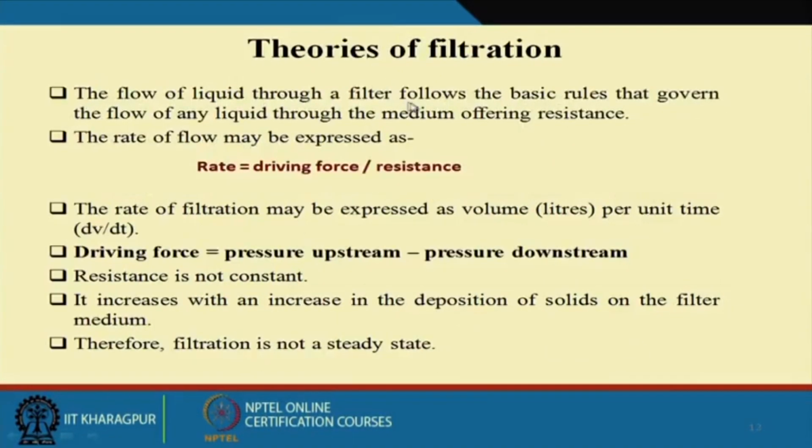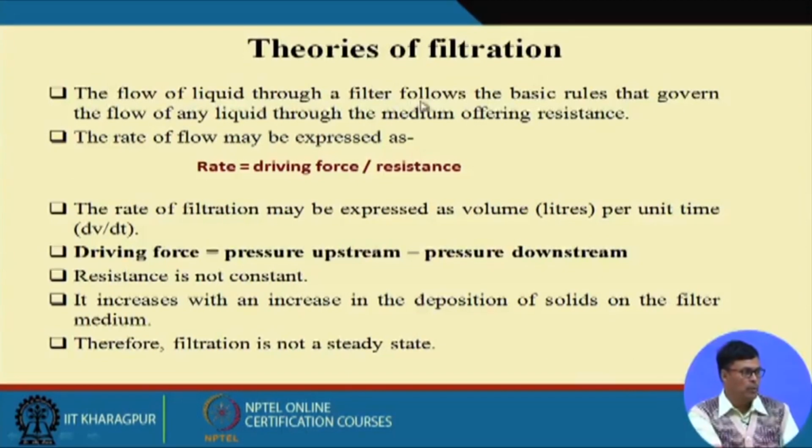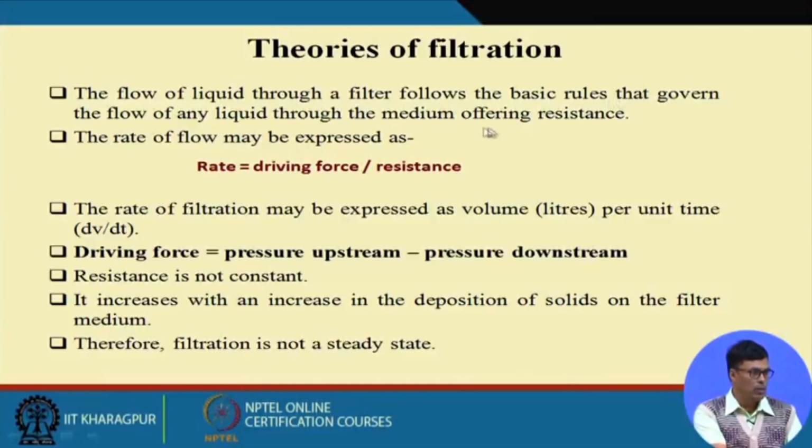Now the theory of filtration is that the flow of liquid through the filter follows the basic rules that govern the flow of any liquid through a media offering resistance. The rate of flow may be expressed as the driving force divided by resistance. The rate of filtration may be expressed as volume per unit time, that is dV by dt. Driving force is the pressure upstream minus the pressure downstream. Resistance is not constant. It increases with the increase of deposition of the solid on the filter media.